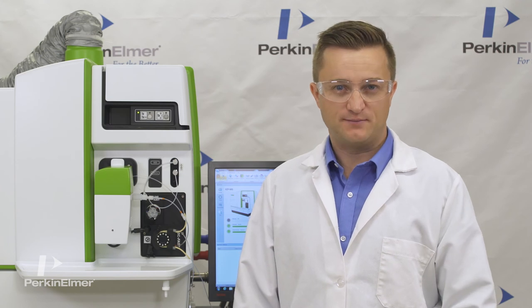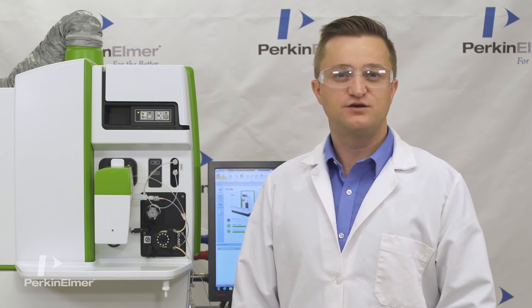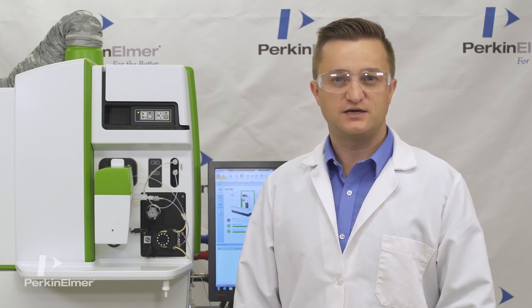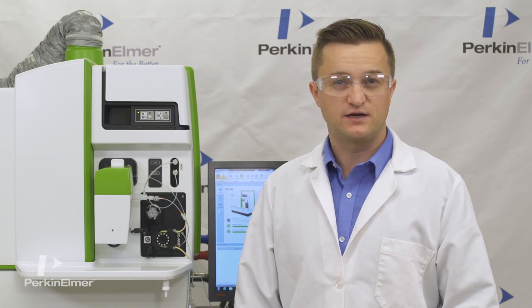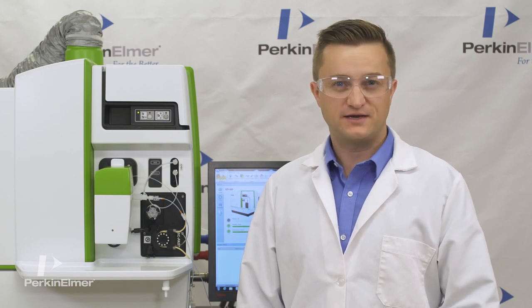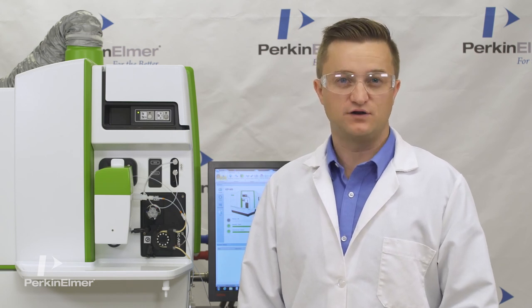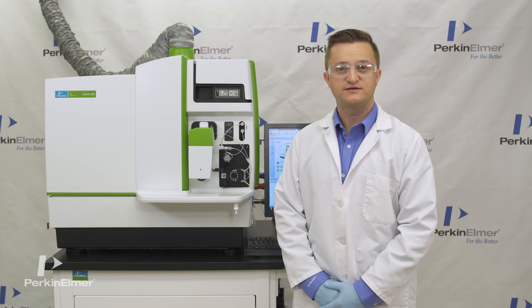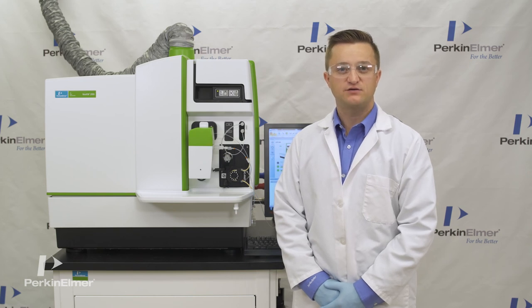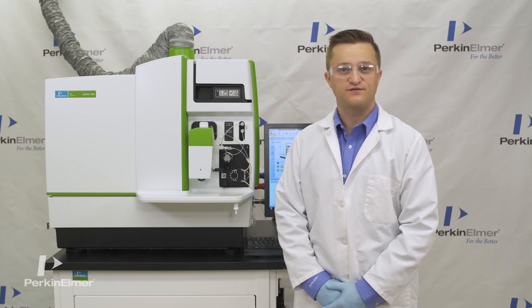I hope that we've demonstrated some of the Nexion 2000's key benefits for our customers in terms of high versatility, low maintenance, and ease of use. Nexion 2000 ICP-MS. Any matrix, any interference, any particle size.